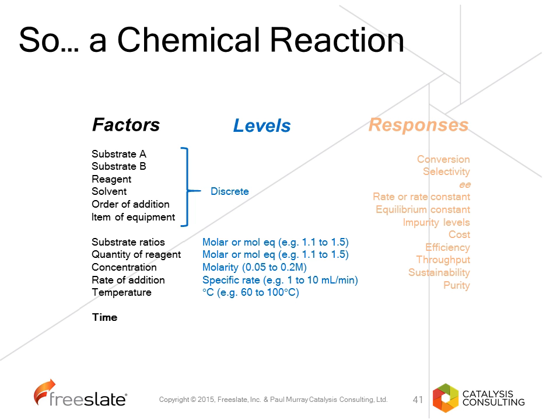In my experience, it is better for you to generate reaction profiles and take multiple samples from each reaction. And therefore, I would always recommend that you do not run reactions and vary the time, but that you run the reactions and take samples at multiple times. I also recommend that you do not use yield as a response.